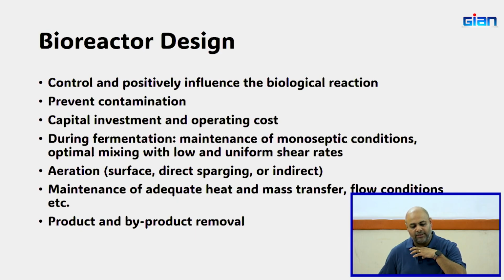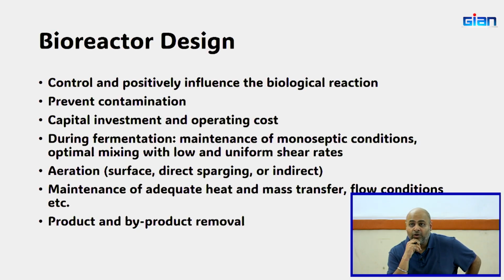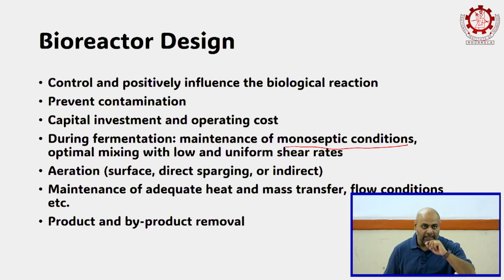Now, the bioreactor design, there are a couple of other things that are involved in it. So those will be your control and the positively influence the biological reactions, and you have to prevent contamination. The capital investment and the operating cost, we already discussed that. So during fermentation, maintenance of monoseptic condition is very, very important. So anything and everything that is added inside is sterile.